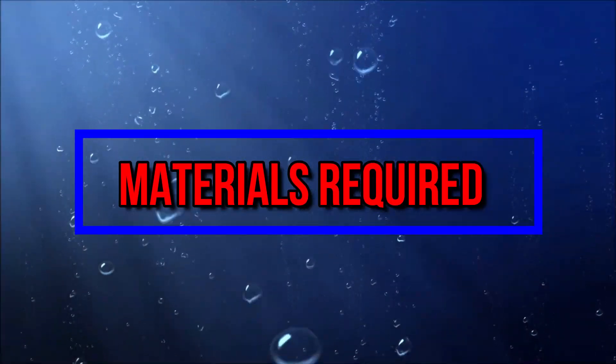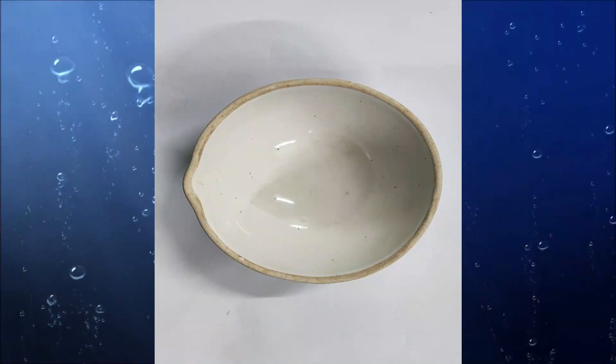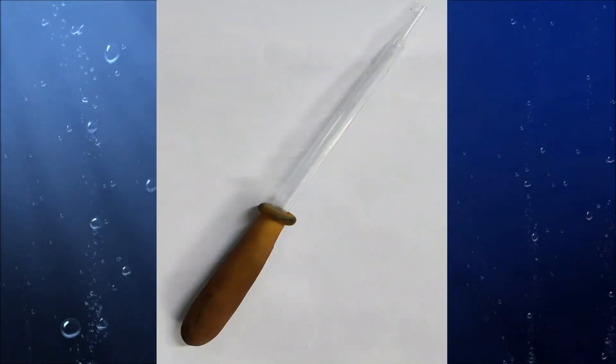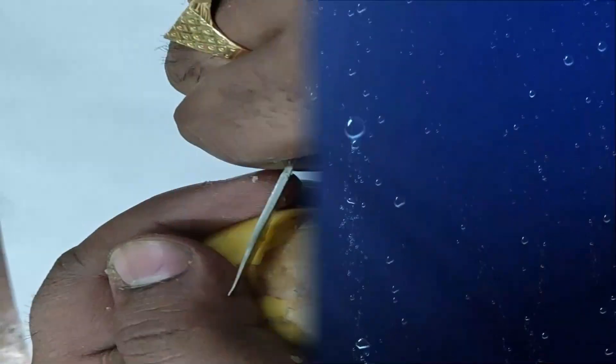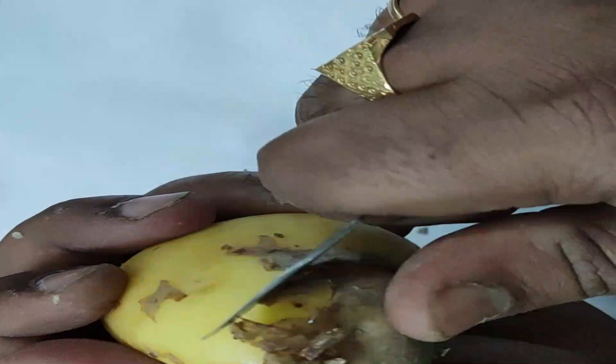First, we'll take the potato and remove its skin with the help of a knife.